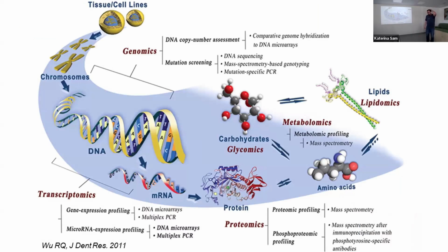On this first slide, we have a very well-known figure. Maybe this area is very comfortable for you. It's the genomics and transcriptomics analysis. But for this day and for this presentation, we are here. We measure the small molecules. Typically, small molecules are molecules with weights under 1,000.